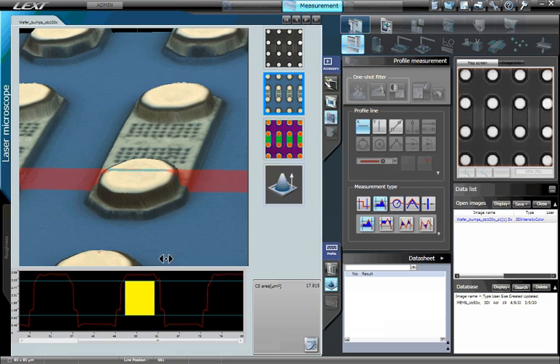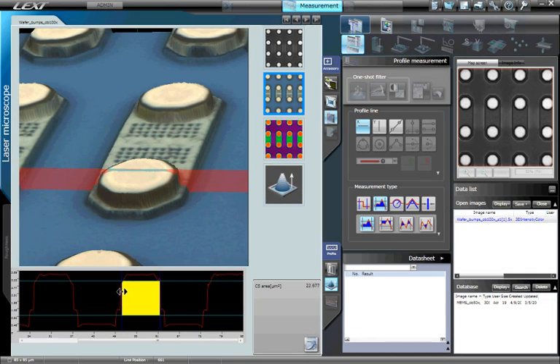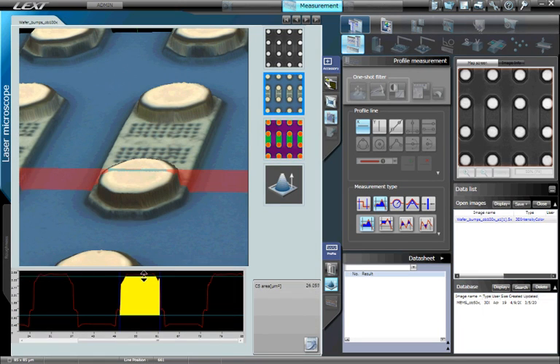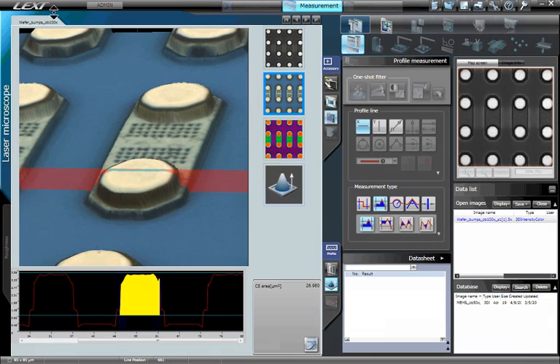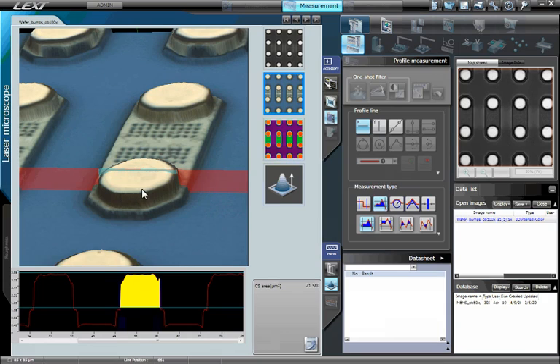Simply move the horizontal and vertical threshold lines to the desired measurement area. The cross-sectional area measurement is displayed on the right of the graph.